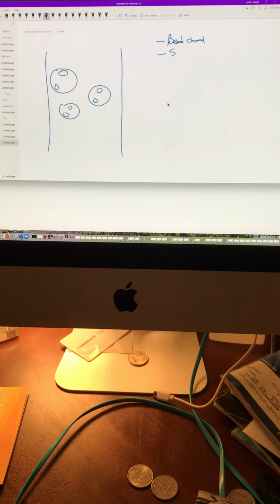Bead chromatography is also called size exclusion. So you have a big protein and a little protein, or this works for DNA and RNA too. The little guy is inquisitive, and he goes into all the holes, like, what's in here? What's in here? And the big guy doesn't want anything to do with it. He goes right through because he's excluded from going through the holes.